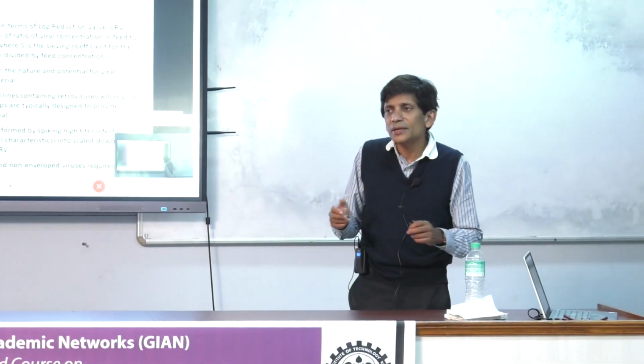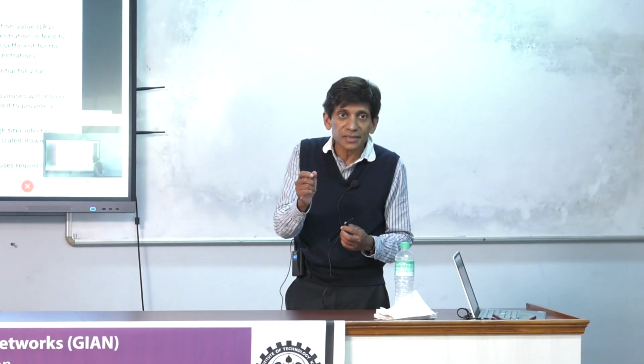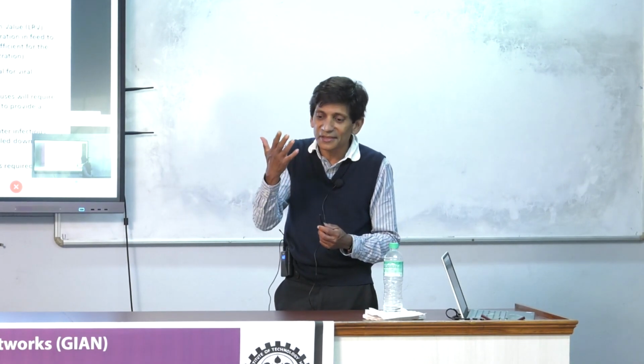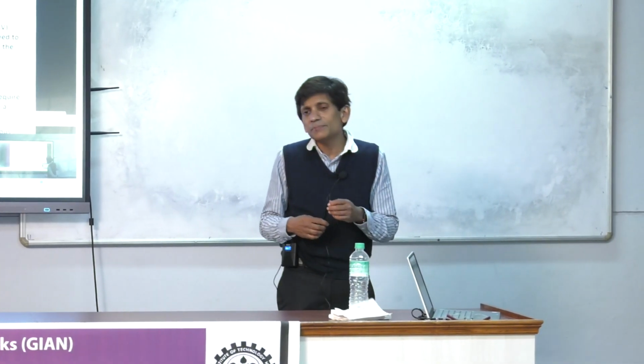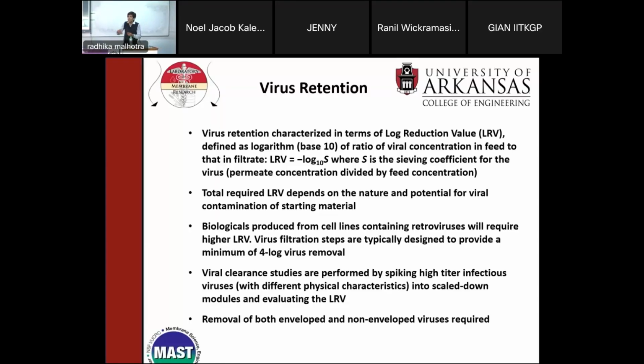There are other ways you can use PCR methods, polymerase chain reaction methods. You should know that from COVID-19. So basically you're taking the viral DNA or RNA trying to amplify it. These methods are not as accurate simply because there's DNA floating around everywhere. So you might be amplifying that, okay? So you've got to be very careful. Now, if your method is specific enough, you wouldn't, but you could.